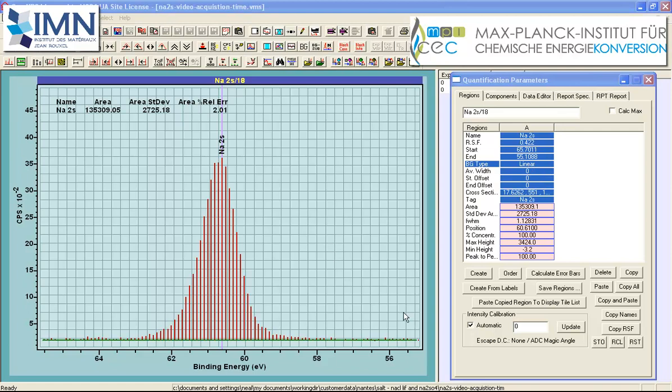data. The linear background is constructed by drawing a straight line between two intensities, one at the start and one at the end. And when the average width is set to 0, a single data bin at either end is used to determine these two intensities. This means that the uncertainty in a single data bin is the reason the background changes and introduces the error.